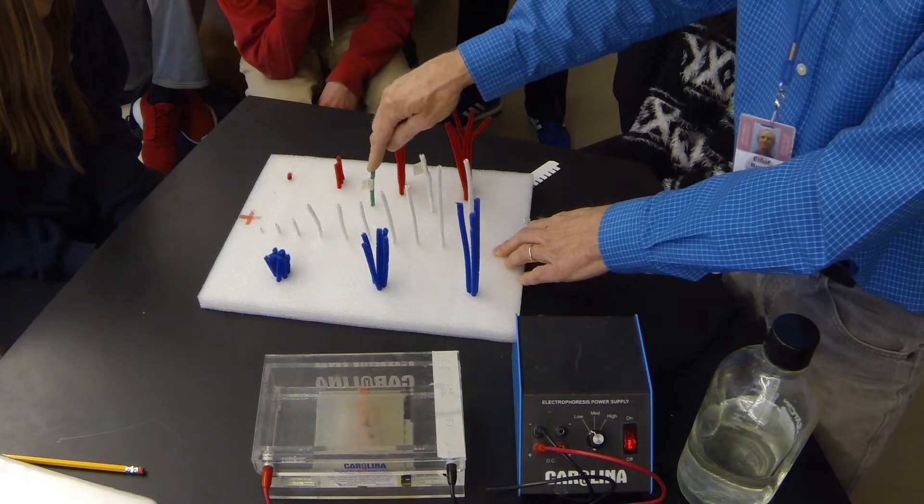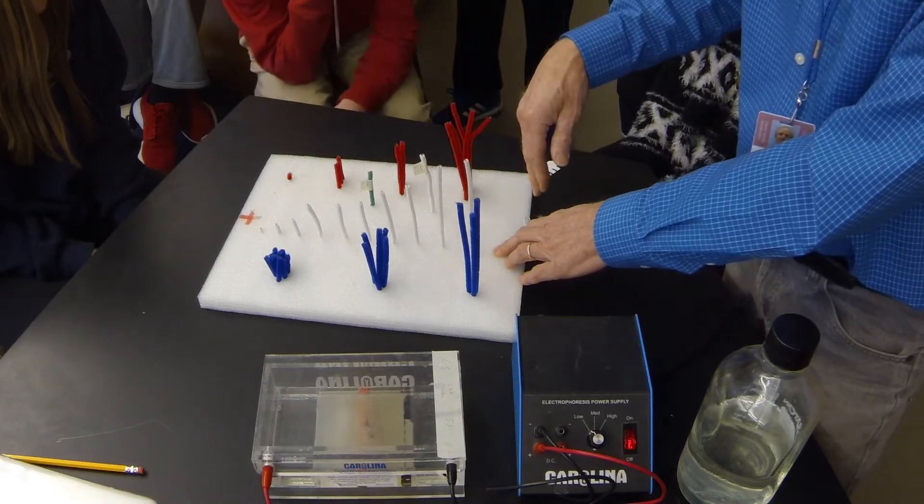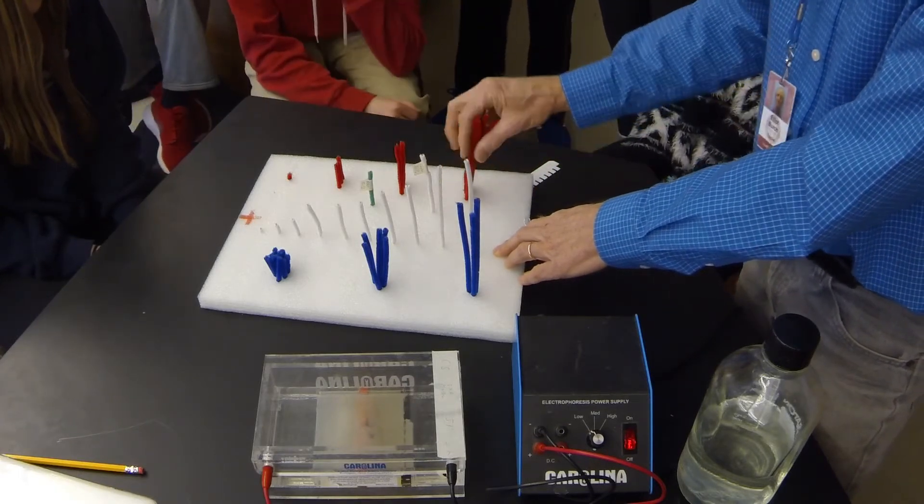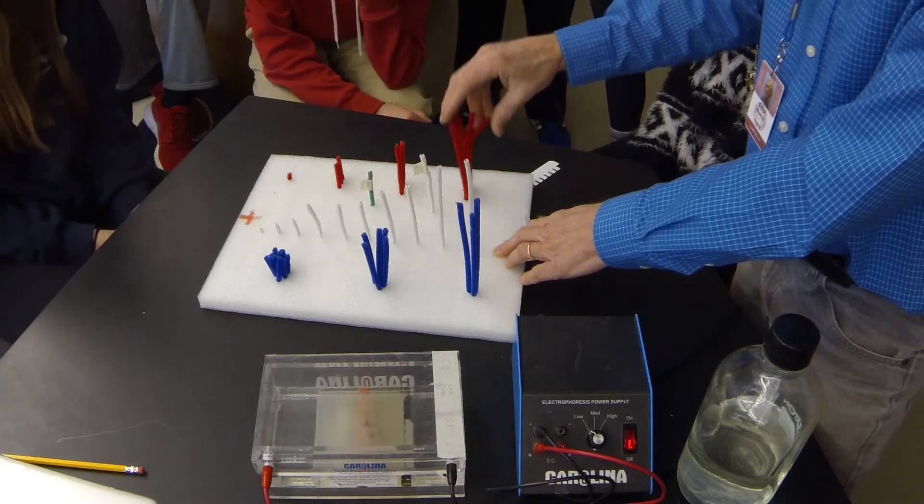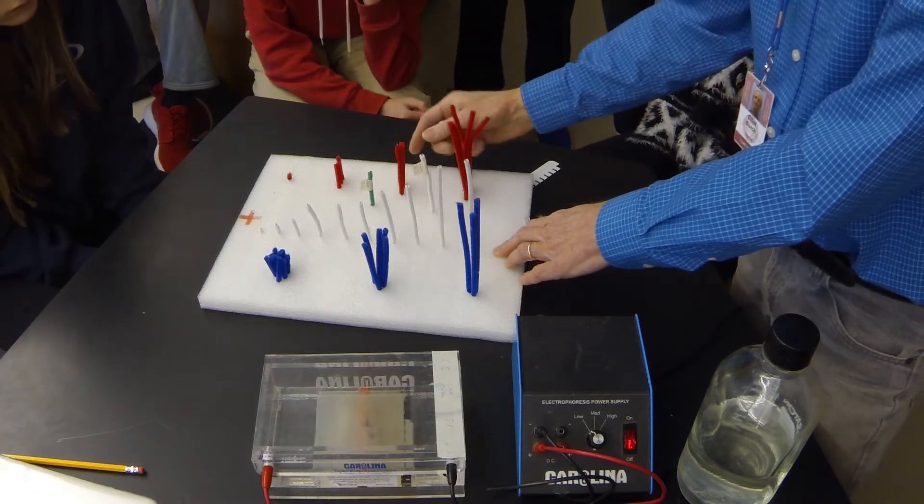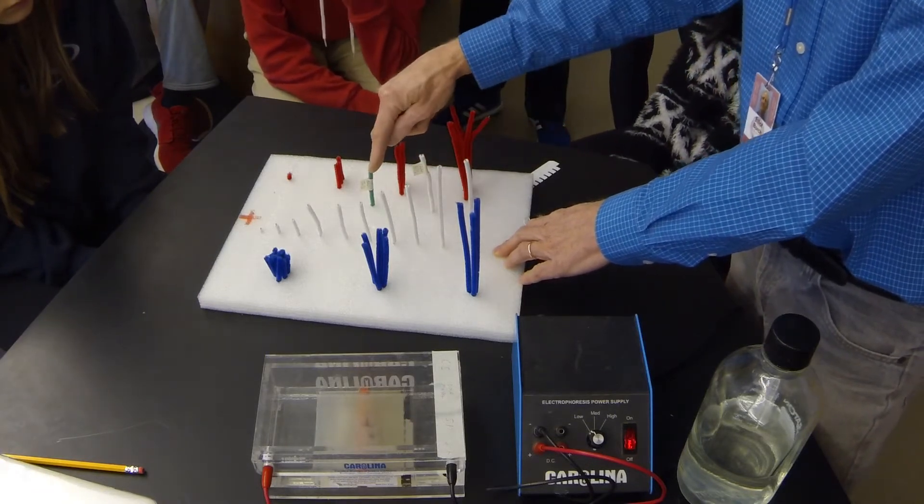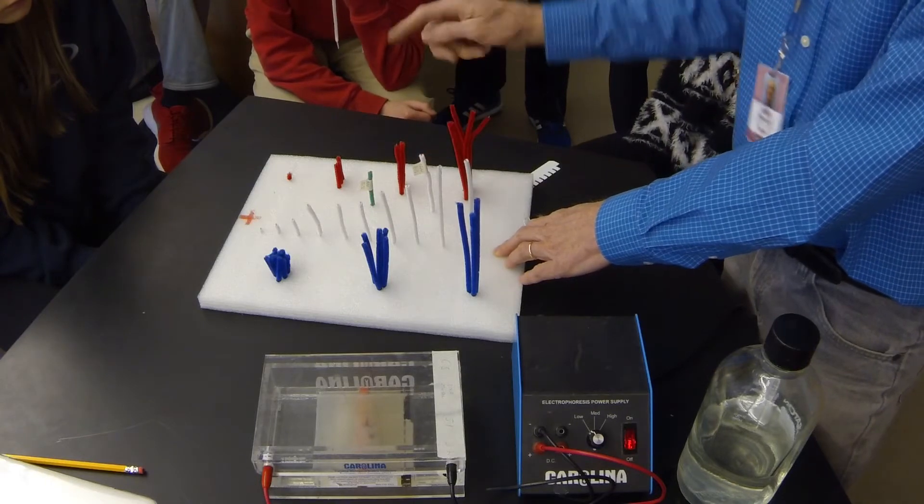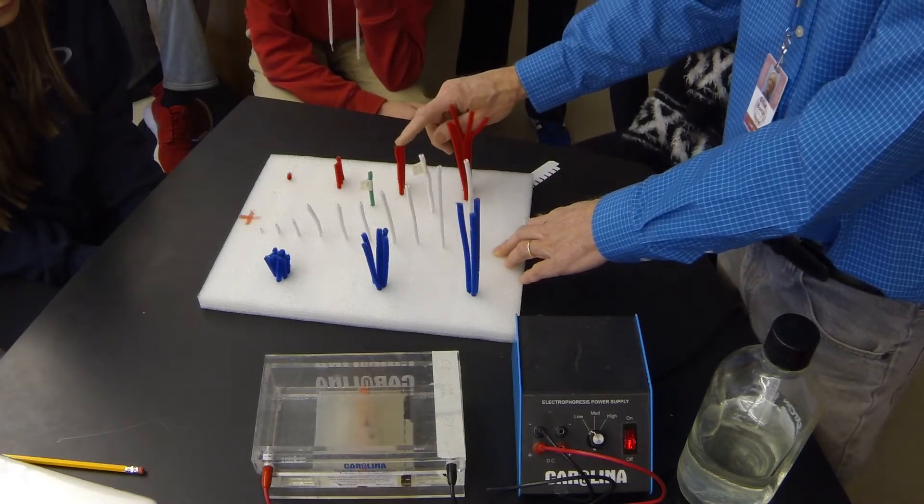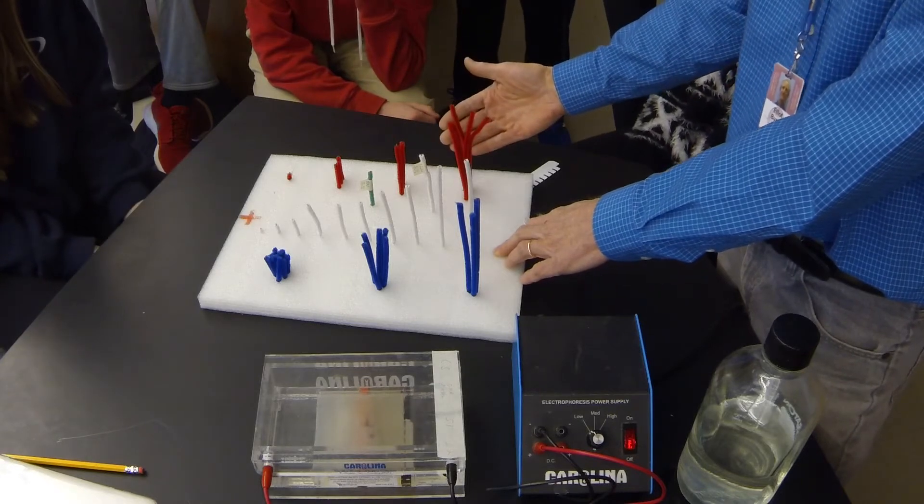I put the DNA size standards into the machine so that I could determine by estimation how big these are. These are halfway between the 800 and the 1200 standard, so you might conclude that the average size of these fragments is about a thousand.